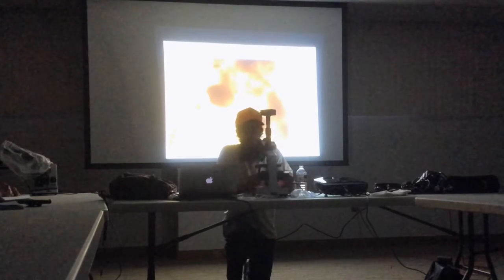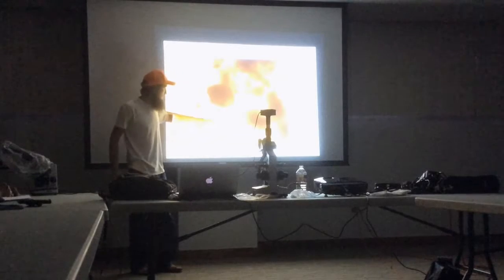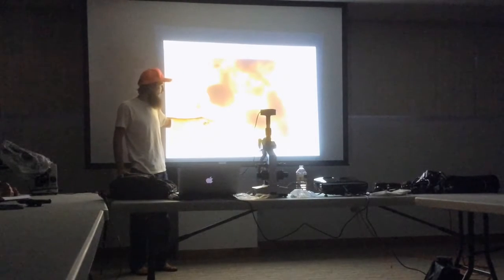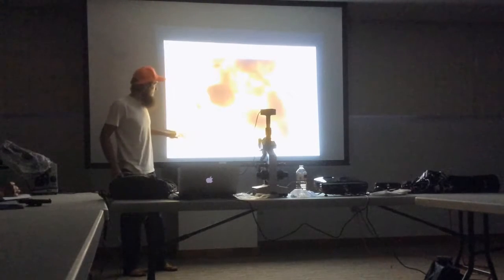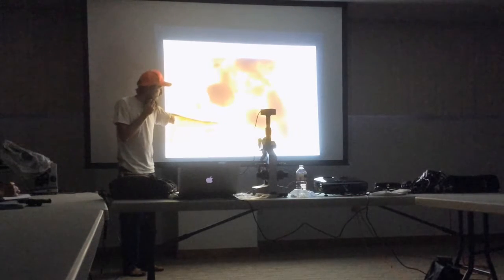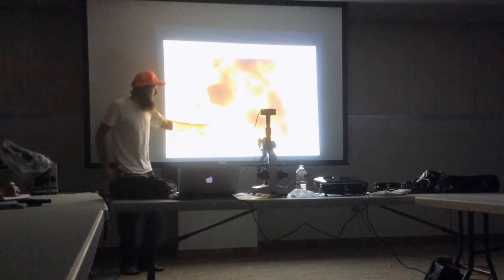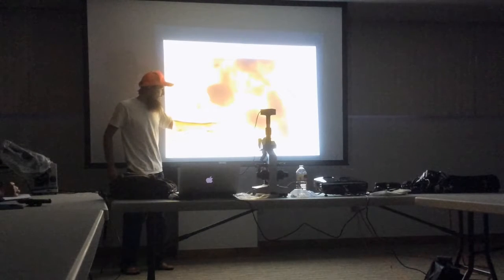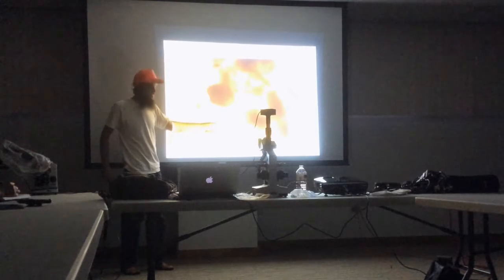And then this right here is a really nice example of a beneficial fungus. See this dark color, this uniform shape all the way through. Hey, Joe, you see the fungus is a little black thing moving around? You know what that is? This is actually kind of perfect. You see how that's one bacteria? Do you see the size of that black dot on there?